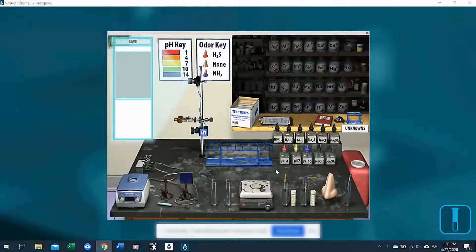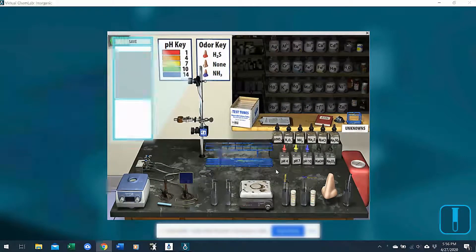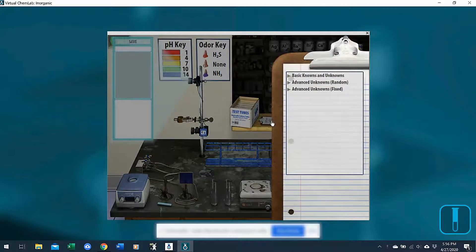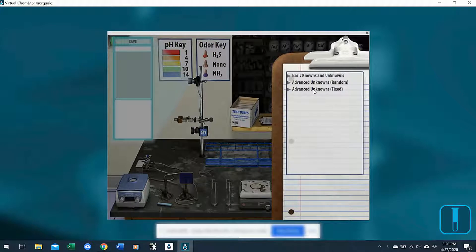Hi instructors, I'd like to show you how to use unknowns in inorganic so you can use this as you need with your students. The easiest way to access unknowns is from the clipboard. When you click on that, there are three basic types of unknowns — basic unknowns or advanced unknowns. They function a little bit differently in how the answers are shown to you, so let me walk you through those.